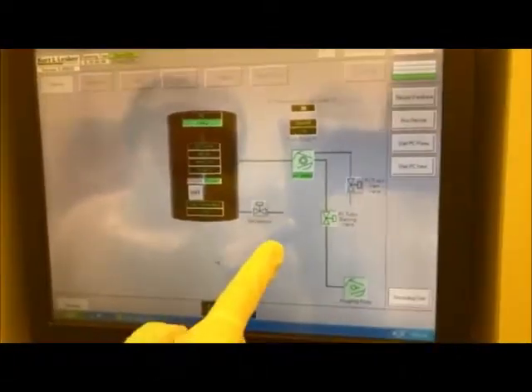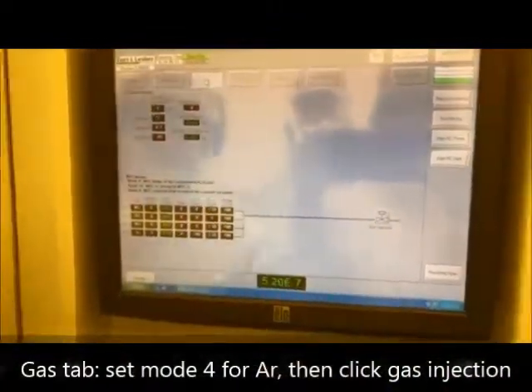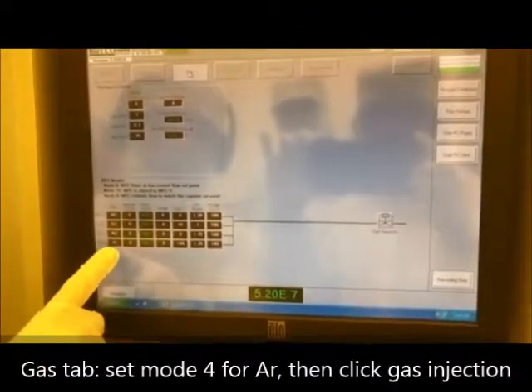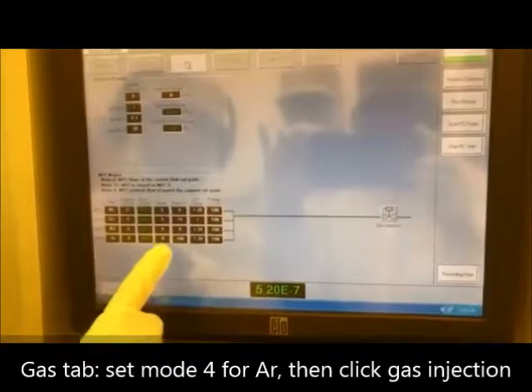After we set the vacuum, we are going to do the gas panel. For the gas panel, most people just use argon, so we will use the argon gas MFC4. Again, all the green is the indicator. White color is the set point.